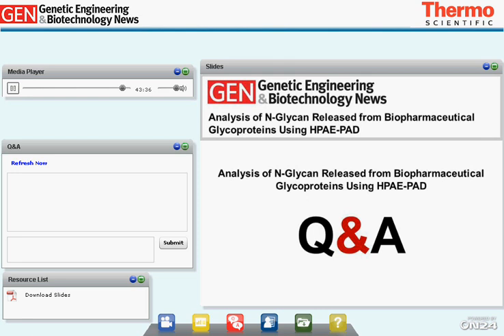So by checking the retention time, we can identify the two distinct sialic acids on the N-glycans, but also after desialylation, the released sialic acids can be analyzed, which we also perform, especially for glycoproteins from CHO cells, which contain a low degree of N-glycolylneuraminic acid. It's an important safety issue for analysis, as N-glycolylneuraminic acid is not synthesized in humans.